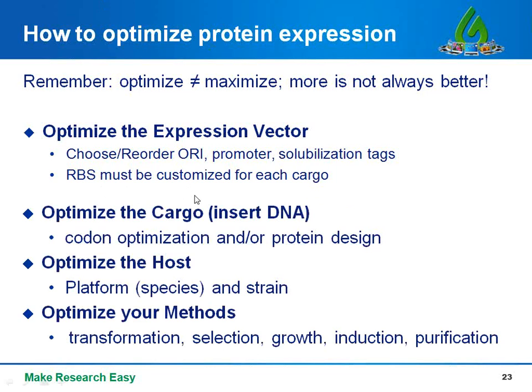I also want to touch on some other aspects of your workflow that you can optimize. You might want to optimize the cargo, so not the vector, but the insert DNA itself. One way to do that is through codon optimization. You can also do more thorough protein design. And then you may choose to optimize the host, that is the platform or the species and the specific strain that you're using for your expression.